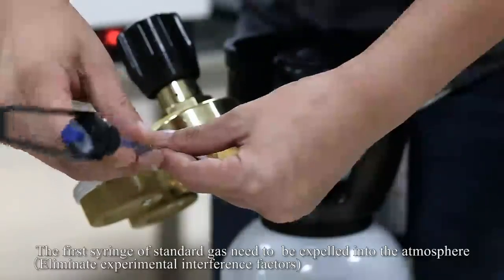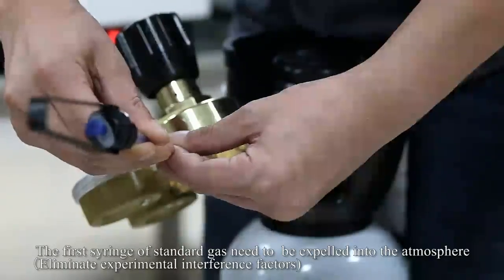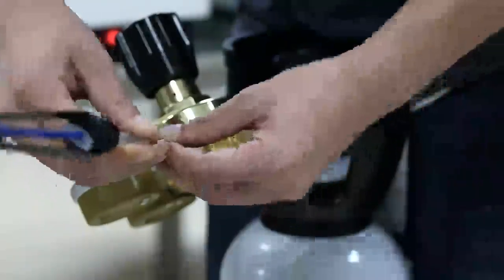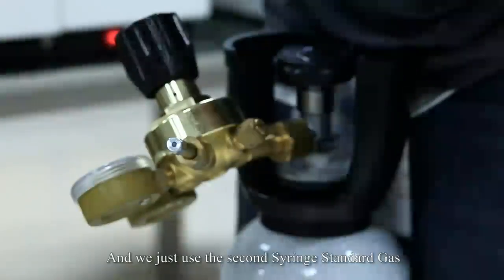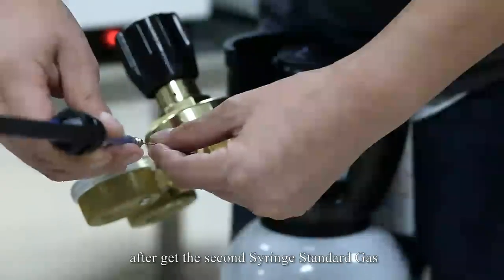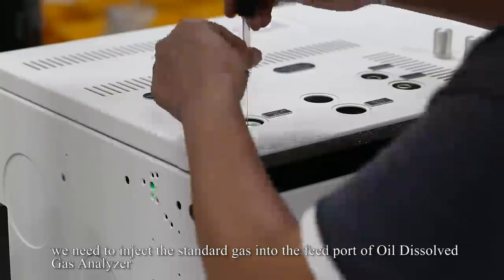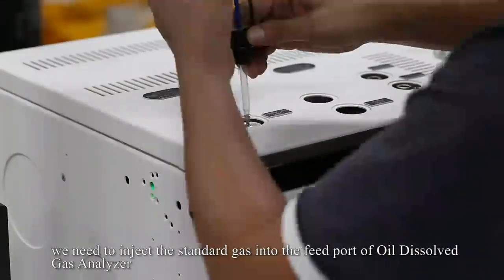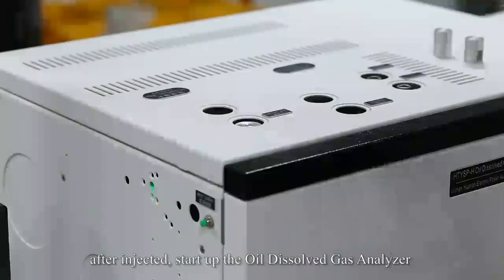The first syringe of standard gas needs to be expelled into the atmosphere, and we just use the second syringe of standard gas. After getting the second syringe of standard gas, we need to inject it into the feed port of the oil-dissolved gas analyzer. After injecting, start up the oil-dissolved gas analyzer.